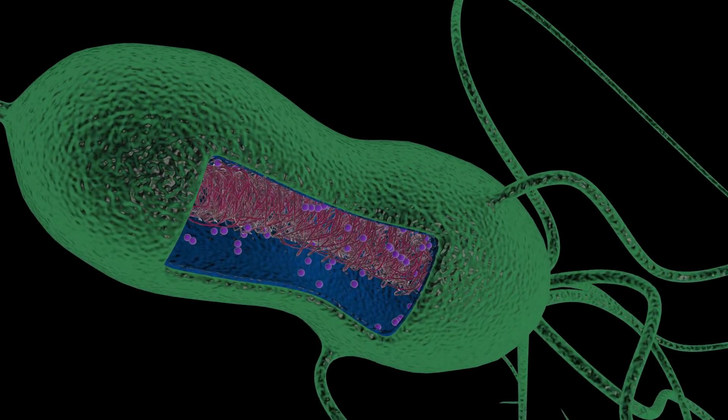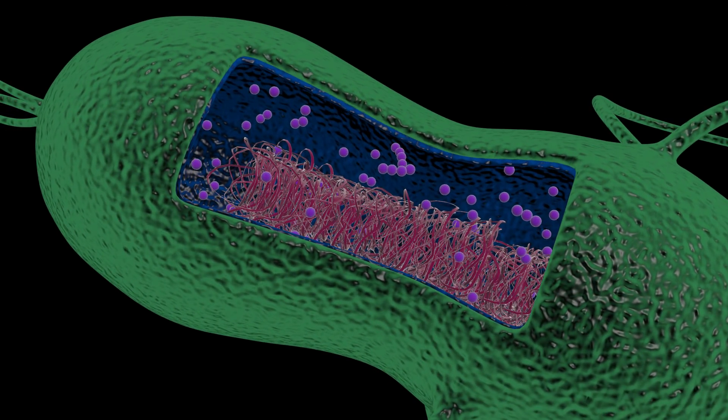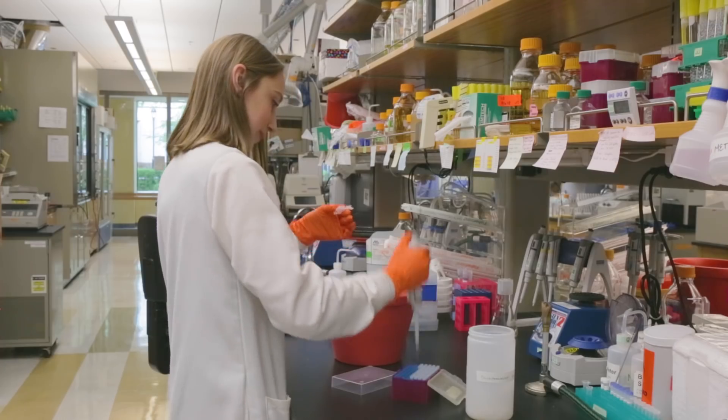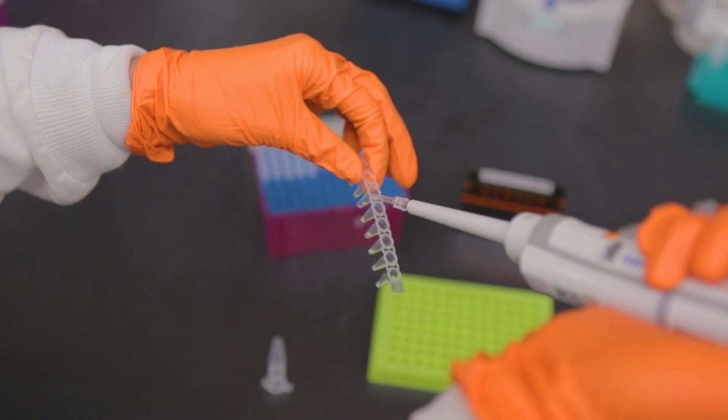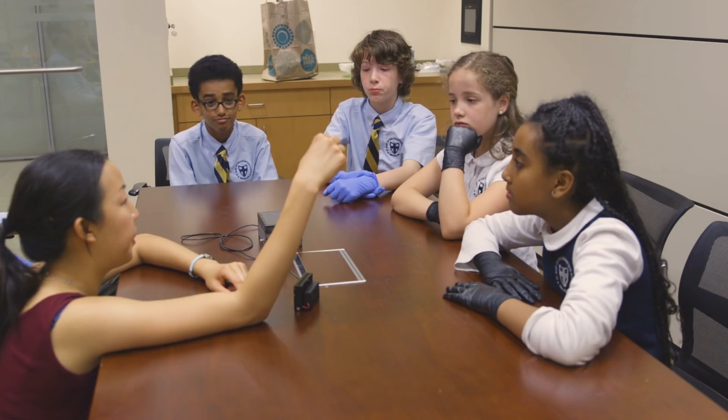The nature of the kit is the idea that you can freeze-dry cell-free extracts. What that means is you rip off the cell wall and collect the guts of the cell — think of it like taking a car, opening the hood, and taking out the engine. We've taken the engine out of a cell: the ribosomes, the amino acids, that kind of thing, and put it into a separate solution. If we just add DNA to that solution, transcription and translation will happen and you'll get your protein output.